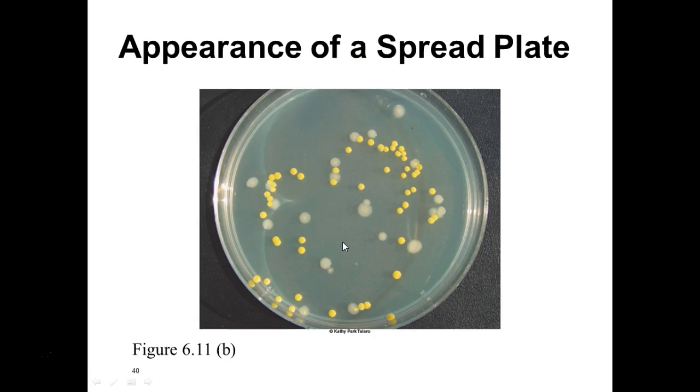And you can see this was probably definitely a mixed culture because you have two different colors. Organisms typically are going to be just one color under set conditions. So if this plate was, say, incubated at 37 degrees, one of them produced this yellow pigmentation and the other one is kind of whitish.